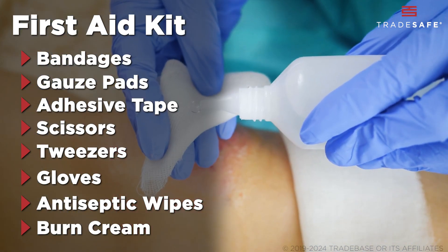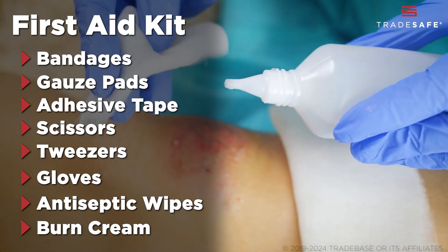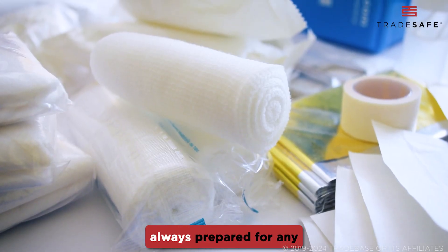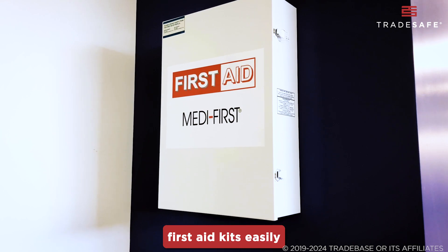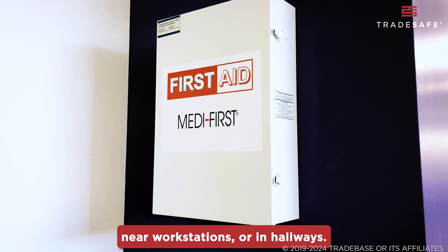Familiarize yourself with your first aid kit's contents and the basic first aid procedures. Always check and restock your first aid kit regularly, especially after it has been used. This ensures you are always prepared for any minor medical situation. You'll usually find first aid kits easily accessible in common areas of the lab, near workstations, or in hallways.